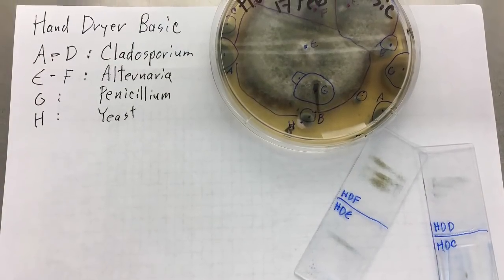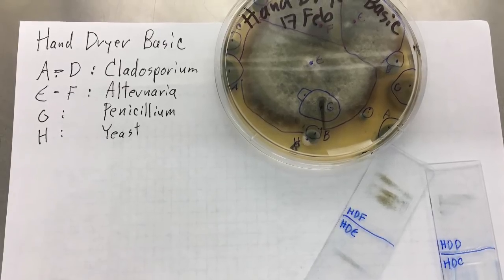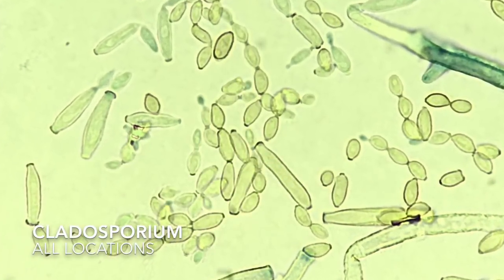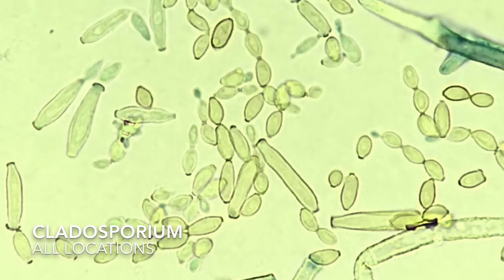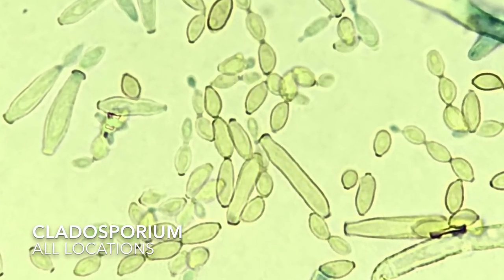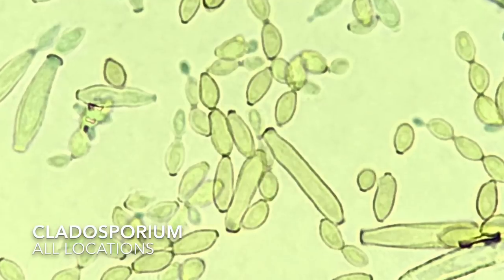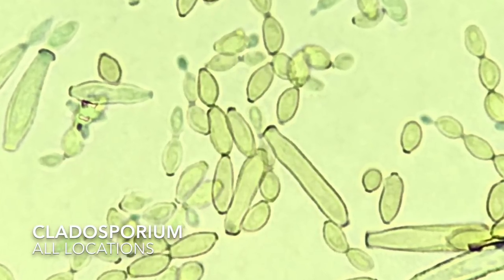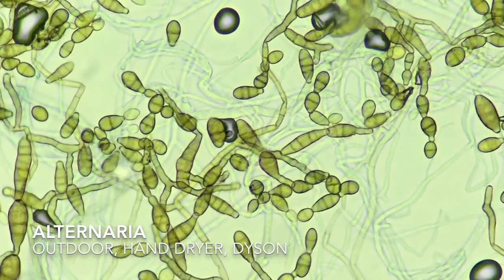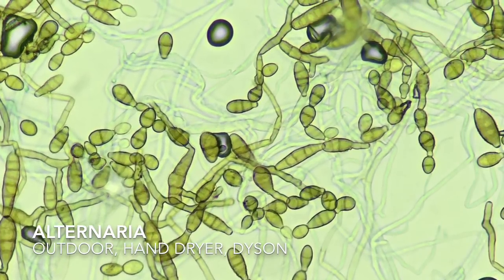Now let's have a look at the fungi that actually grew on our plates. I will list each fungal genus that was found and which sites they were taken from. First we have Cladosporium, which is very commonly associated with grass. It is a decomposer that grows on dead grass thatch and other decaying vegetation — you can find incredible blooms of Cladosporium after a lawn is mowed and irrigated, for example. Next we have Alternaria, a decomposing fungus typically found on decaying vegetation, very common in the outdoors.